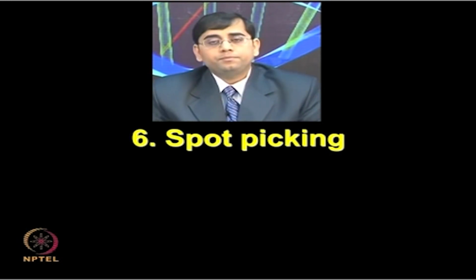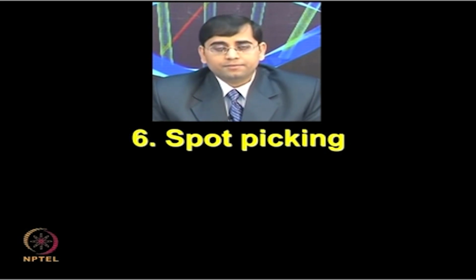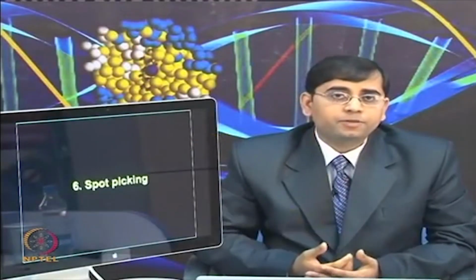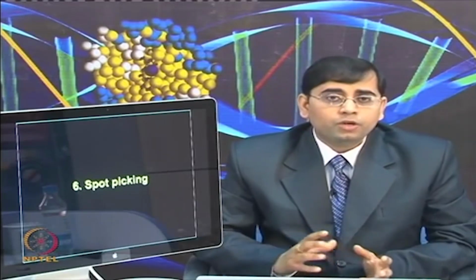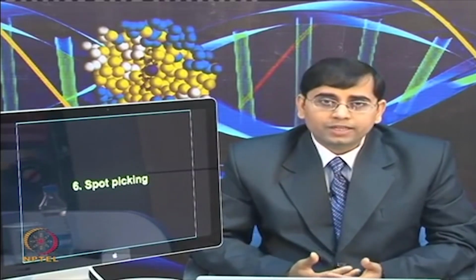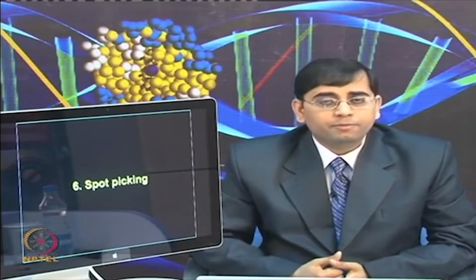Now, most of the time people compare their control and treatment gels, which is abundance based proteomics, where you are looking at change in only a few proteins because of a given treatment, a given disease or a given condition. If you compare this way, the number of protein changes overall is not going to be very large. Maybe you will have 50 to 100 proteins maximum which alter their overall pattern because of a given treatment.